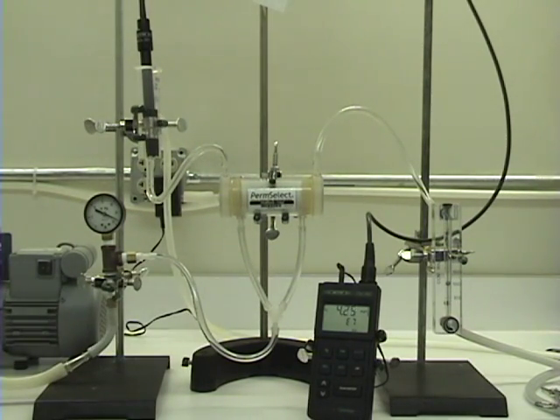We are currently at less than one half the inlet condition.